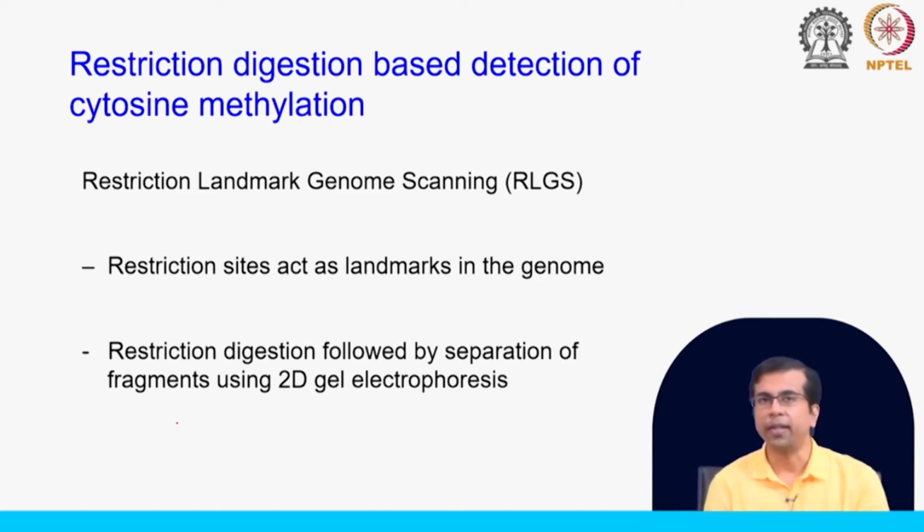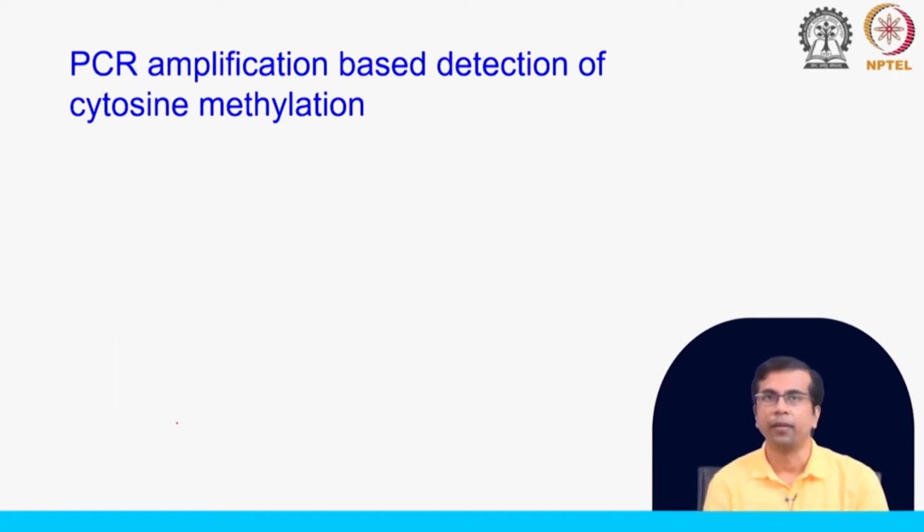But again, you probably realize, right, because genomes are big, you cannot do this for a huge number of fragments, right. So, this means there would be limited throughput, right. So, you can do only for certain specific region or of certain size. Okay. So, this actually limited the throughput.